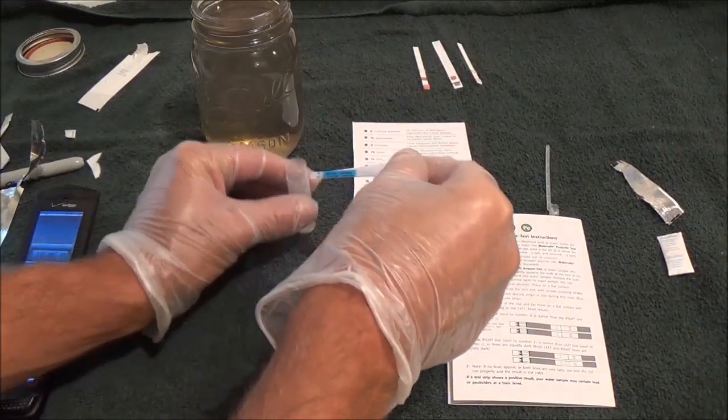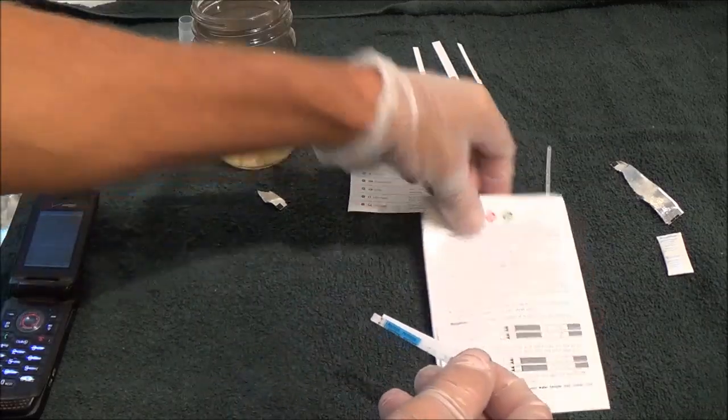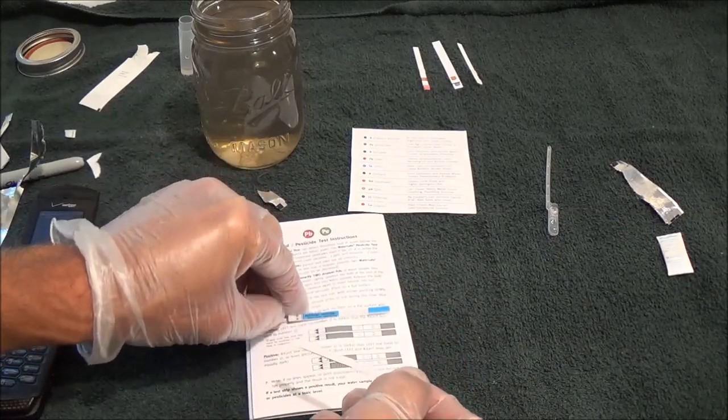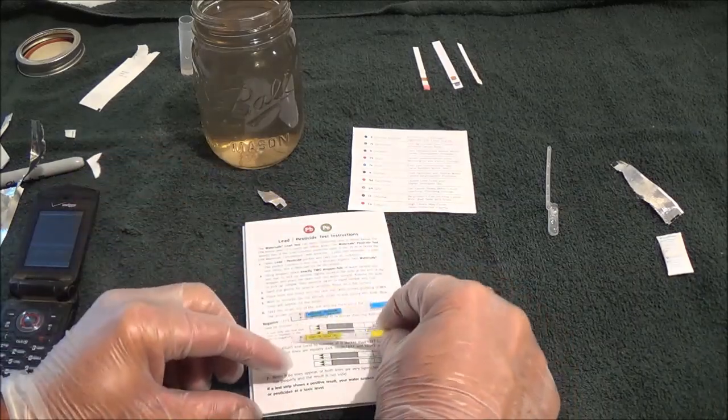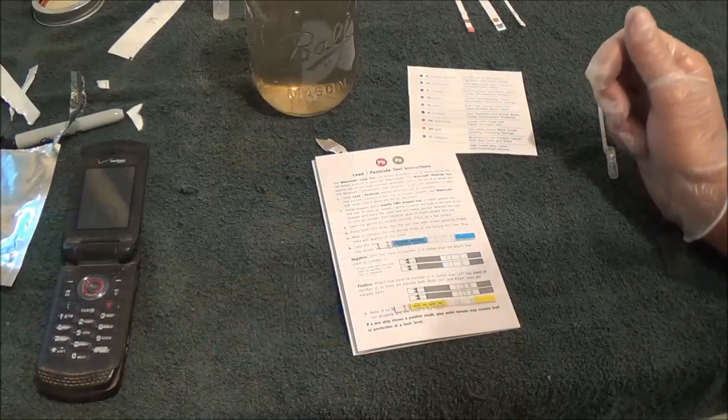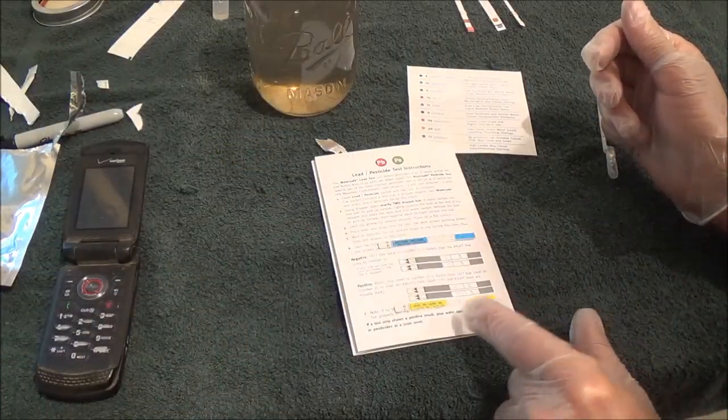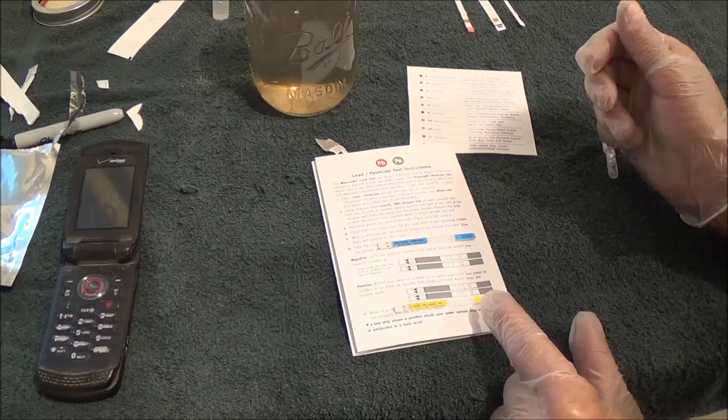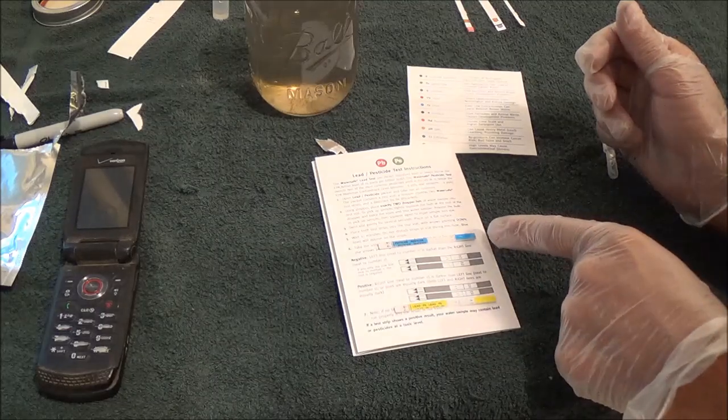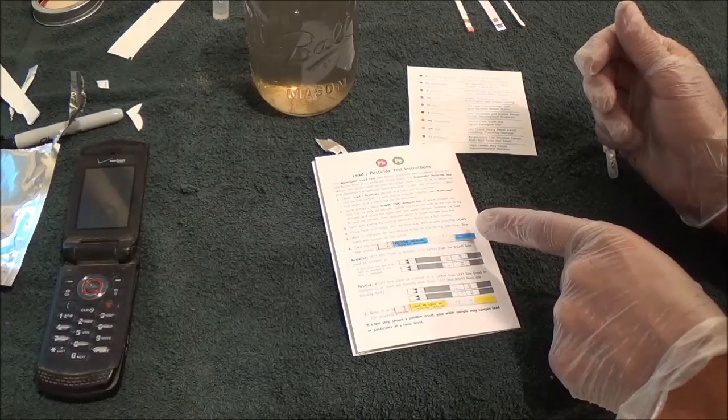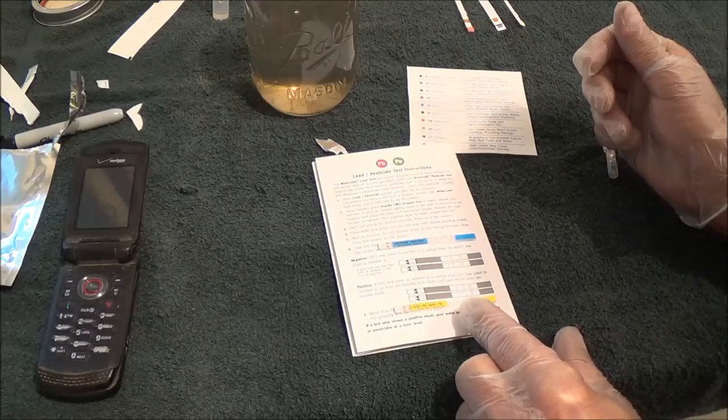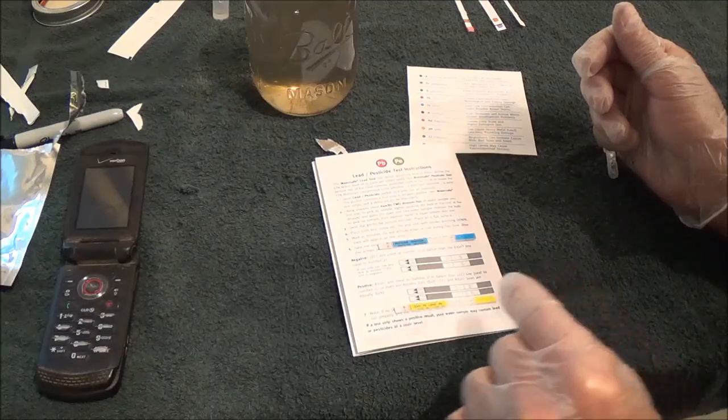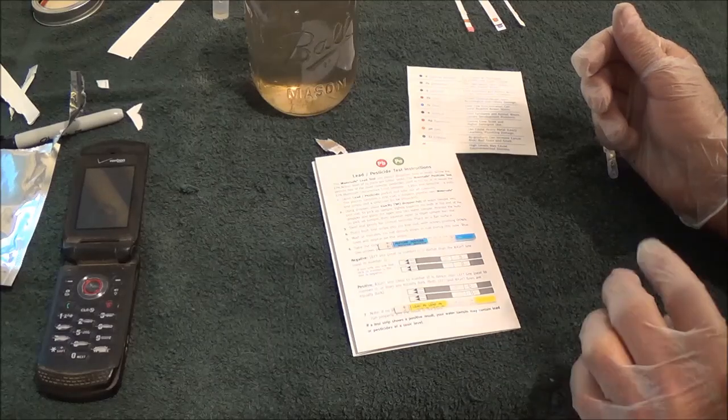Okay, so our 10 minutes are up. I had to stop for a second so I could read it. So negative means the left line next to number one is darker than the right line next to number two. For positive, it's the opposite. So on both of these, the blue line is close to the number one. Oh, I see, it's not 11 and 22, they just cut these off. That's a one and a two. So for this test here, my lead and my pesticide, both of them are negative.